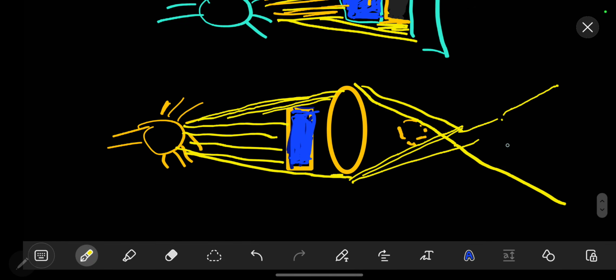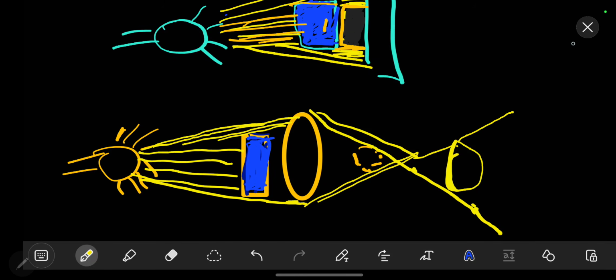Now when the image is formed, the image is formed at this point. Realize that rays of light might pass like that, the rays of light might pass like this. So as we can see, this is our image. Now if you look at the image where it is formed, this one was our specimen. Now this is the image, what we see when we look at the eyepiece.